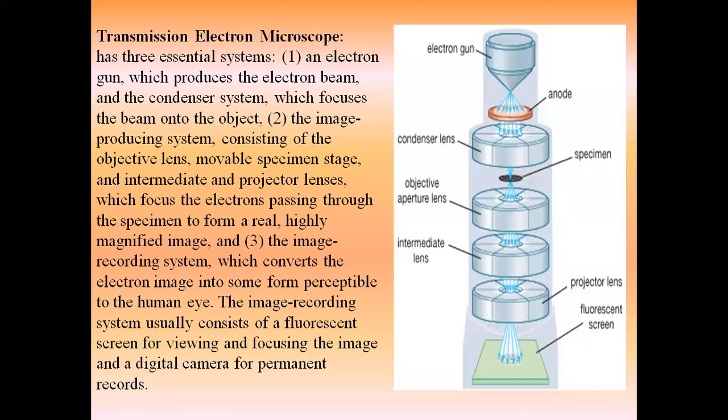So as a result, the image that you get from the scanned electrons will be made on the fluorescent screen. Nowadays, apart from the fluorescent screen, we also use CCD. You might have heard the term in photography. It is the same kind of CCD, that is, a charge coupled device. It captures the image directly instead of using the fluorescent screen.